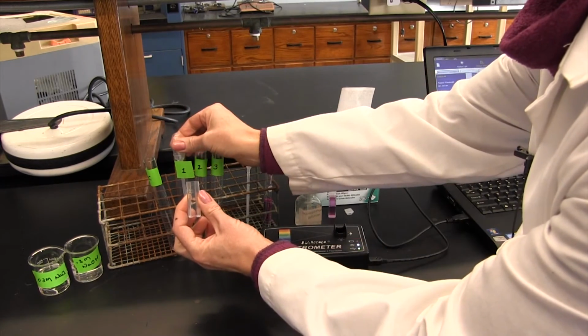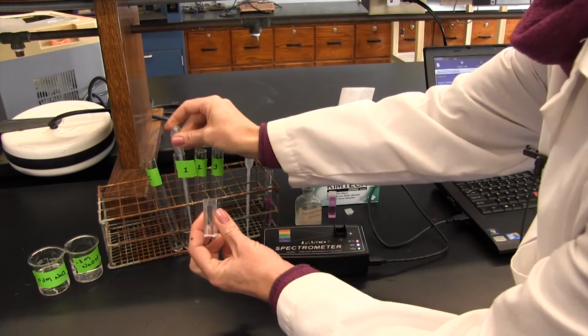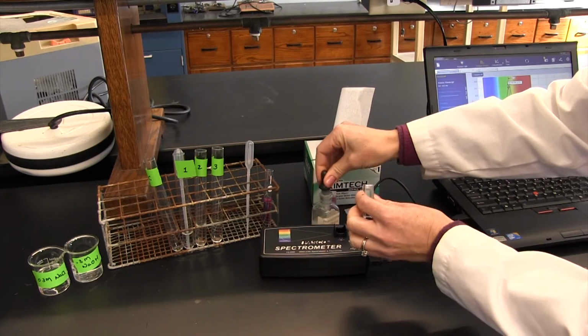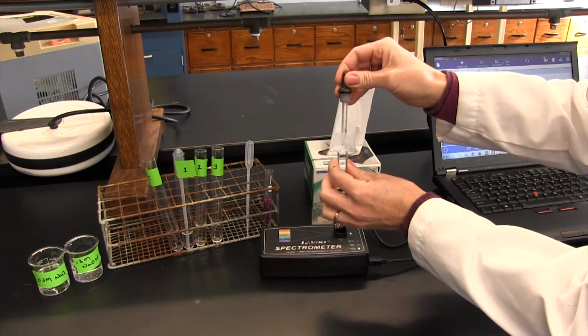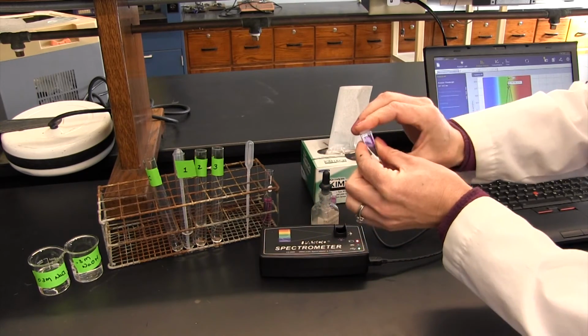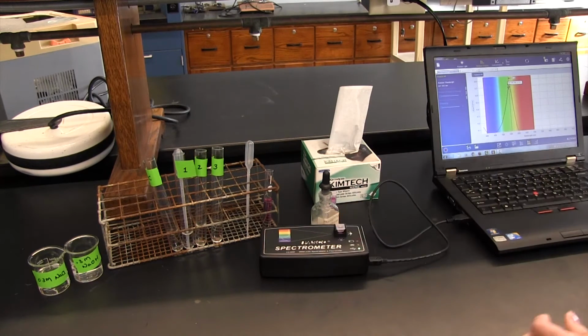So again, fill the cuvette till it's about 2/3 to 3/4 full. To this you'll be adding some phenolphthalein. The directions say 1 to 2 drops. Put the lid on, mix it, and again, insert it with the correct orientation.